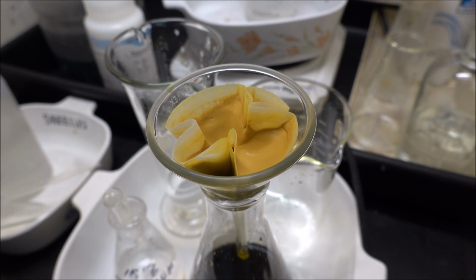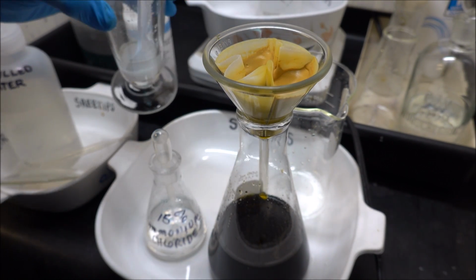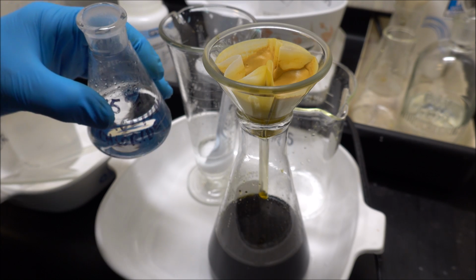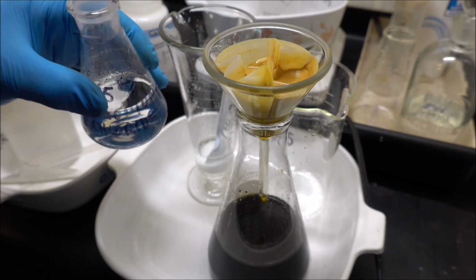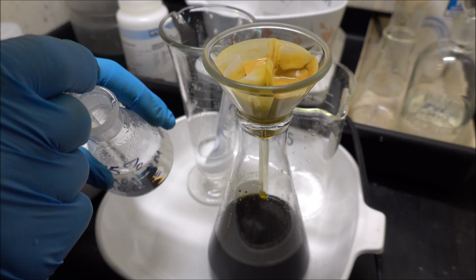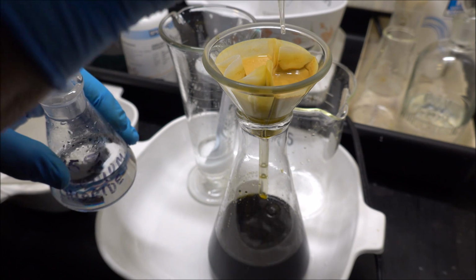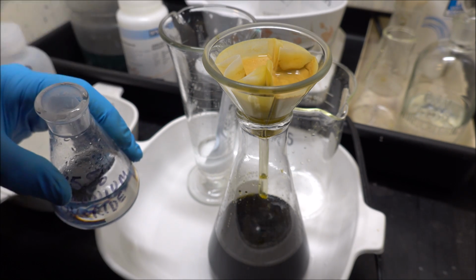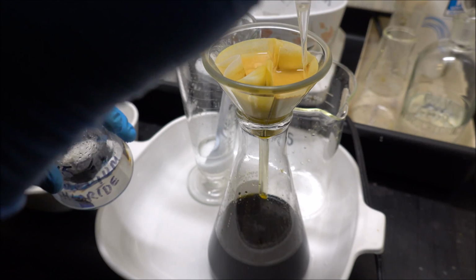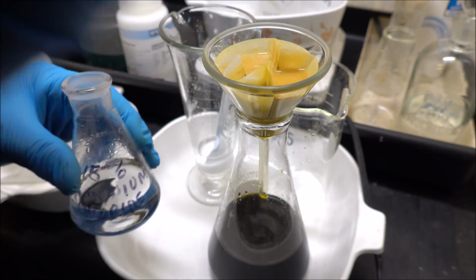Here's our nice platinum salt. What I'll do now is I'm going to add the rest of this ammonium chloride. Well, first let me rinse the platinum out in this funnel. I'll say it one more time. It's important to understand that this salt can't be rinsed off with plain water. Plain water will cause it to redissolve. That's why I'm using 15% ammonium chloride water to rinse it off.